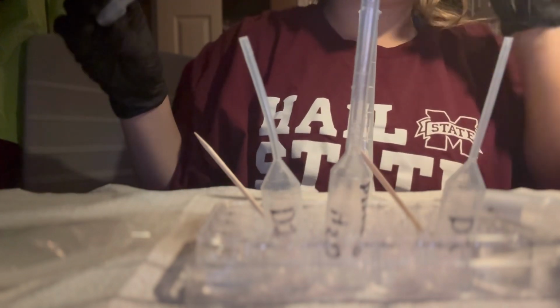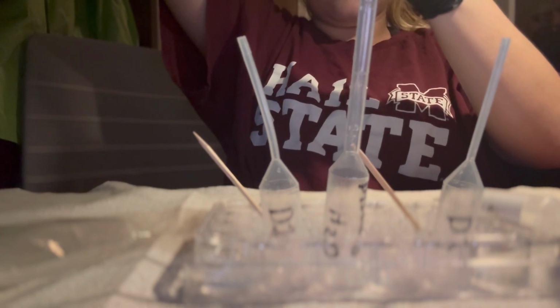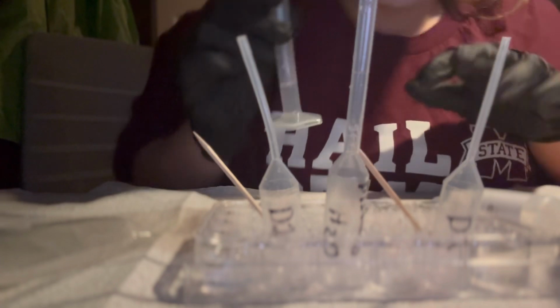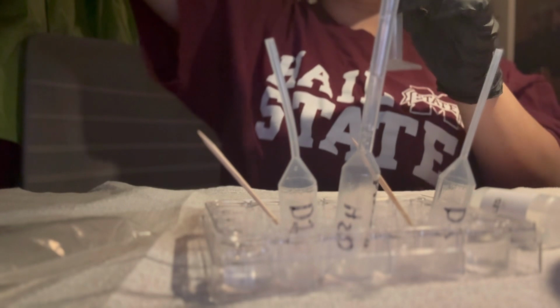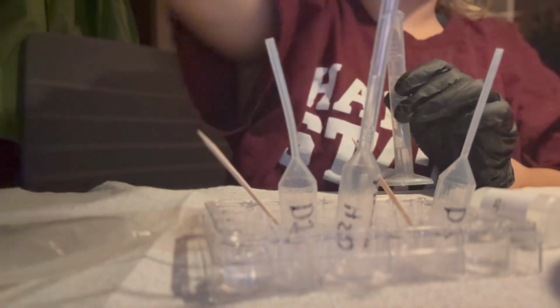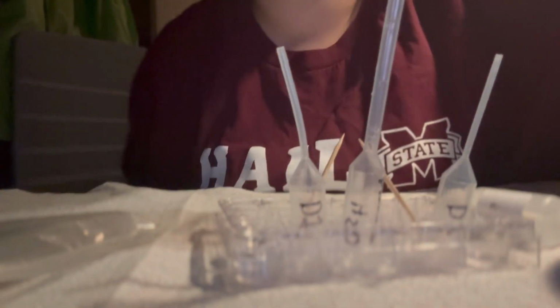Now we'll be using well B1, measuring 2 milliliters of the white vinegar solution. That is exactly 2 milliliters into well B1, which is right here. Alright, and last but not least, we'll be doing well B6. Alright, and now let's see what's next for the experiment.